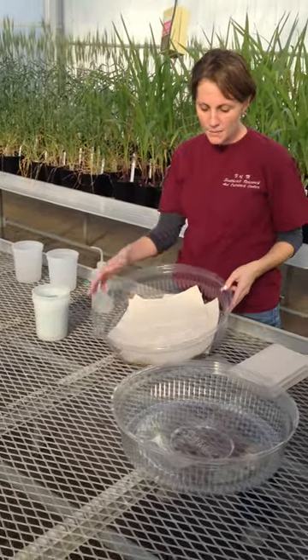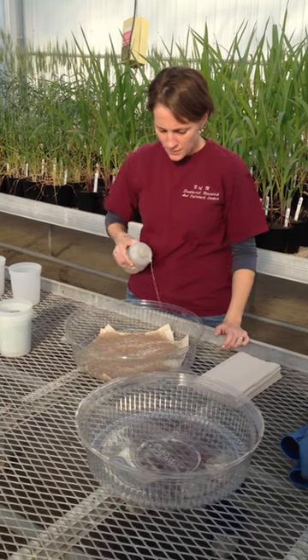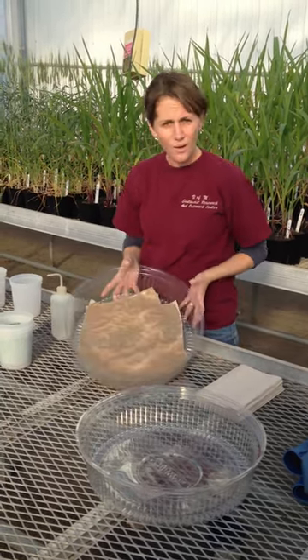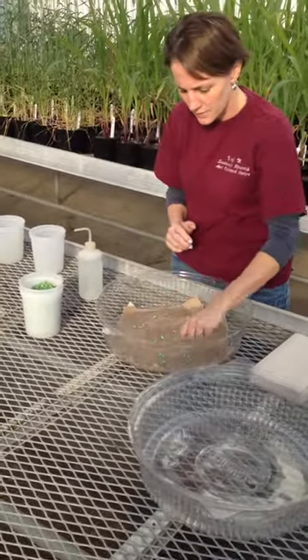You're going to line the bottom of one of the plastic trays with paper towels, and then you want to squirt them to get them pretty damp. Once it's damp, you can take your seeds, take a handful, and you're just going to sprinkle them on.